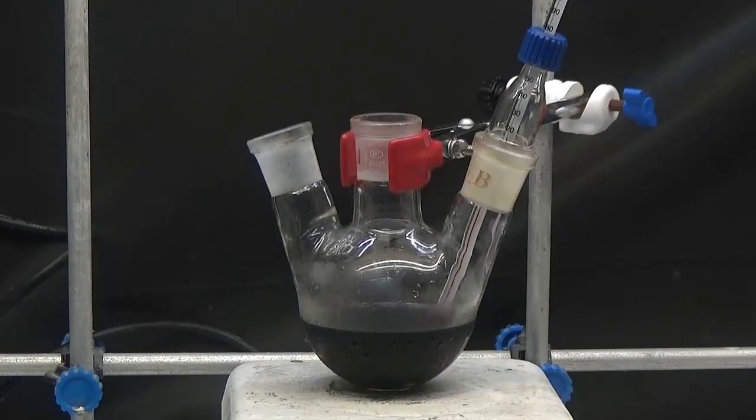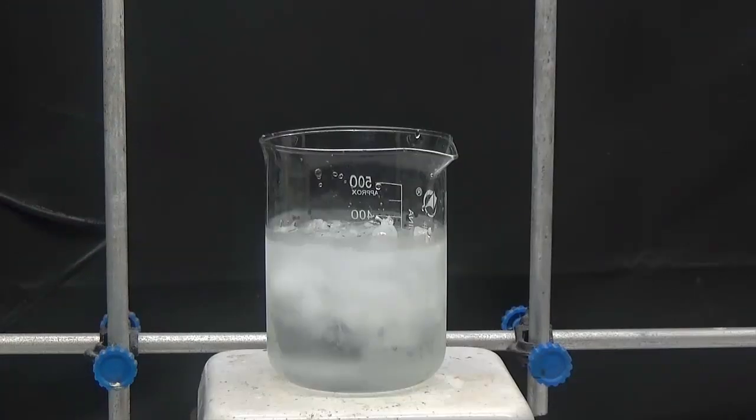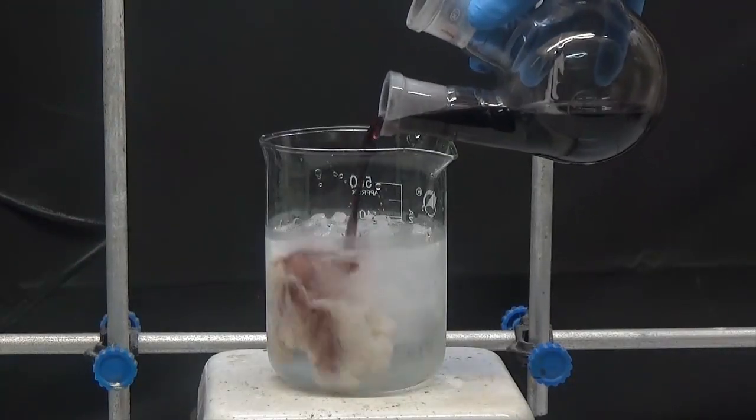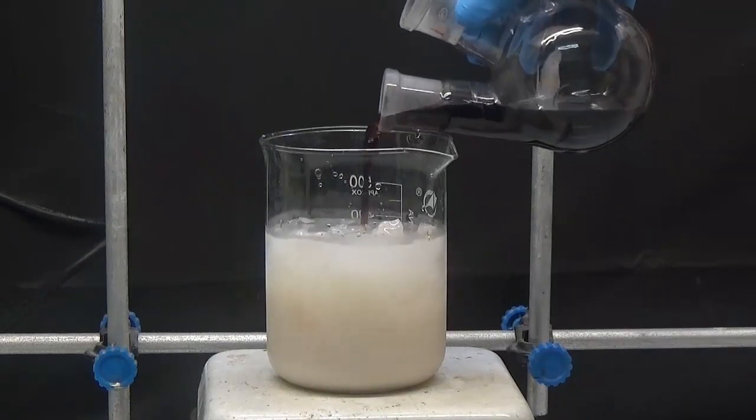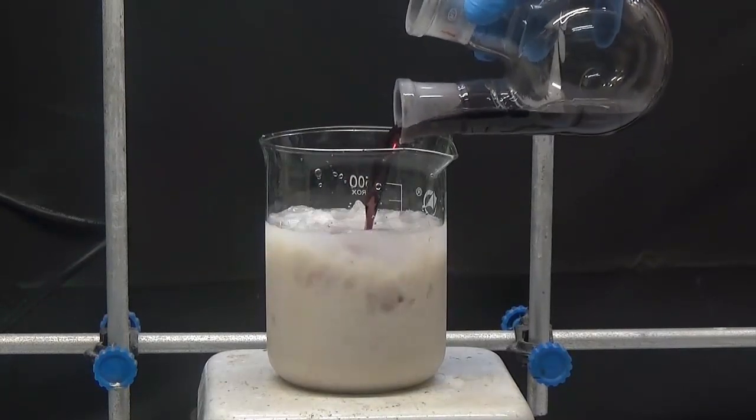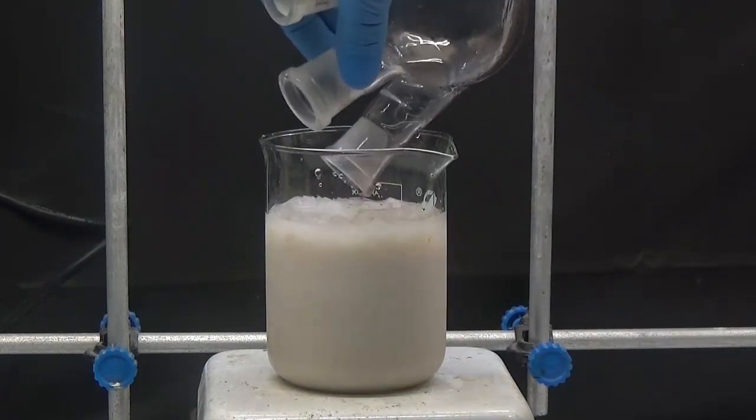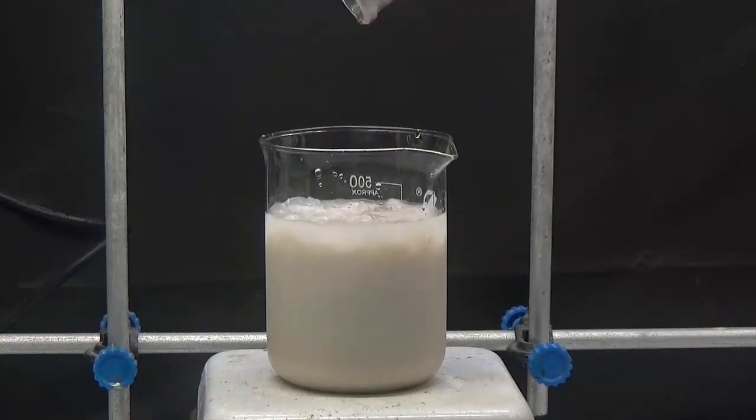After all the resorcinol had been added, it was left at room temperature for 18 hours. After this time, the mixture is poured into a 500 ml beaker with 220 ml of water and 150 grams of ground ice with stirring.